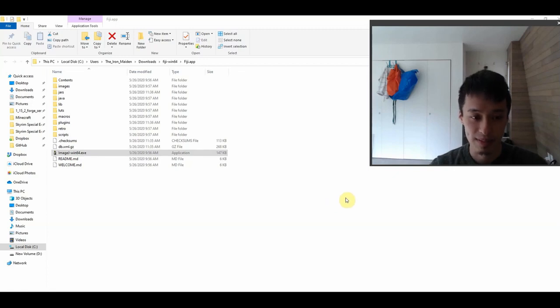And so for this, I'll first show you how to use the program ImageJ or Fiji to manually draw the ROIs, and then we'll transition to a video where VJ and I will show you how to actually draw the ROIs in the most optimal way possible.